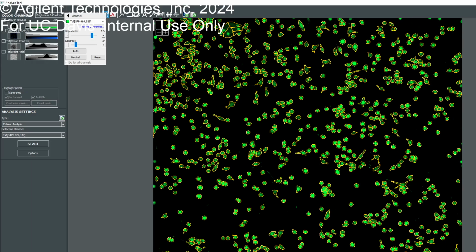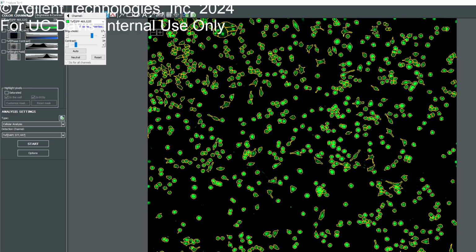Cool. So you can maybe also just use your length and assume that the longer length is the one that's trusting. And there it is per individual cell. And then you also get that for the area, the whole area. I don't know if the area is gonna change because even the circle ones are gonna be somewhat similar in nature. I think I did look at area before and I didn't really see a signal there. Can we try just one quick thing?